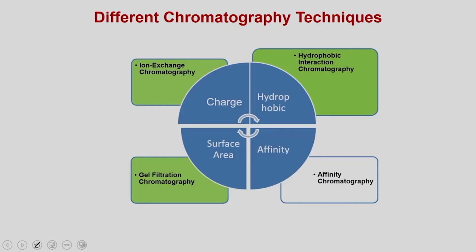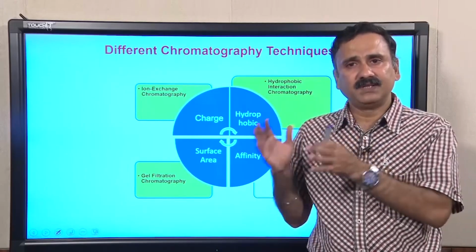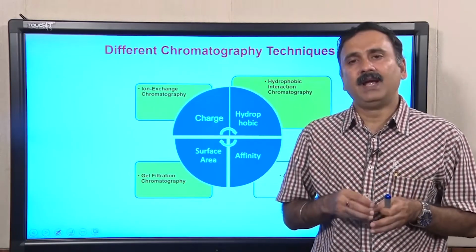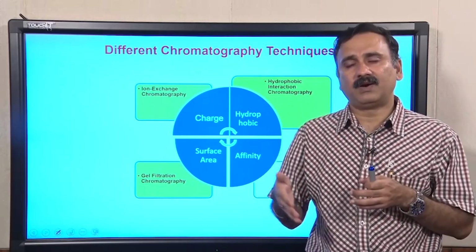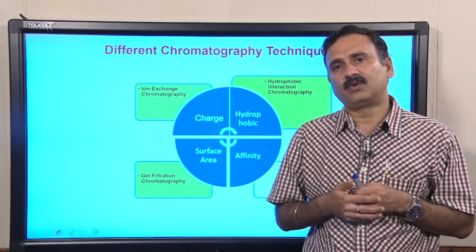So far we have discussed bioaffinity chromatography, or how to generate the receptors to prepare an affinity chromatography column, and very briefly we also have discussed the generic steps, what is present or what is being used to run the affinity chromatography.